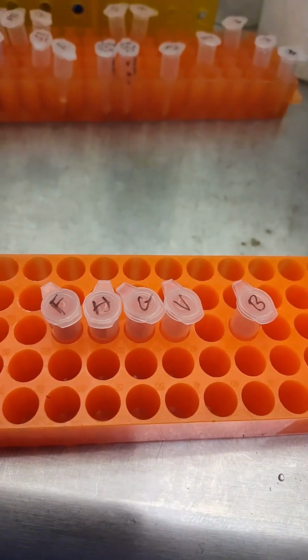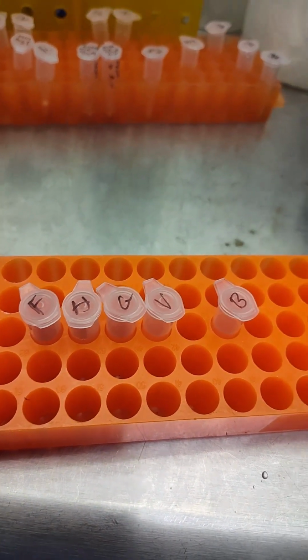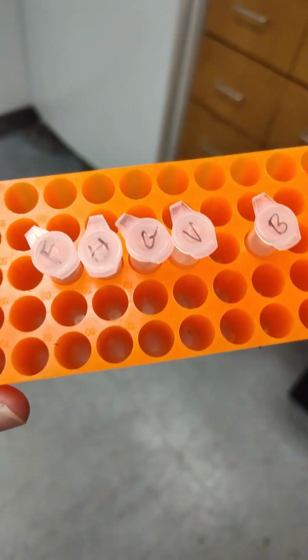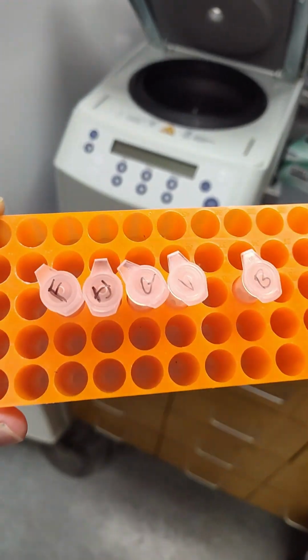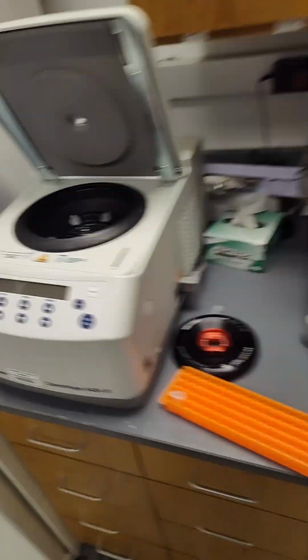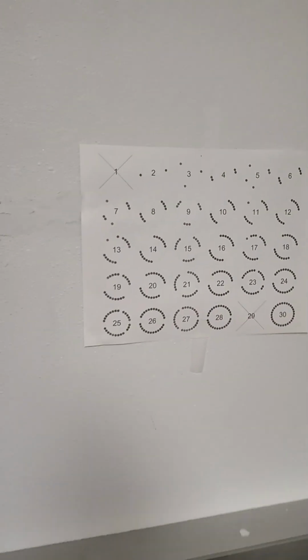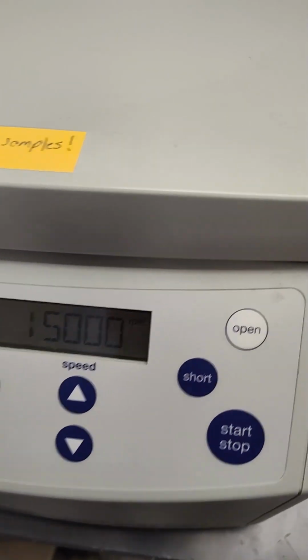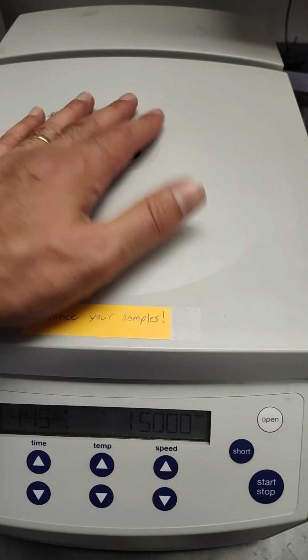Now we've labeled each of those tubes. This is a scientist trick: make sure that the letter you use before you put them in the centrifuge is a different letter. I made that mistake before. Somebody was going to spin these out. Oh, you've got to spin 5 tubes. That's hard to figure out the balance. We got that tube balance list. I didn't do it right. That's 15,000 RPM. Feels balanced enough.